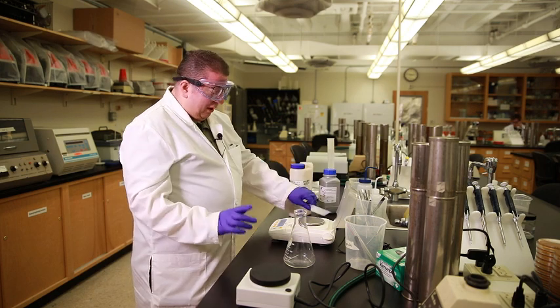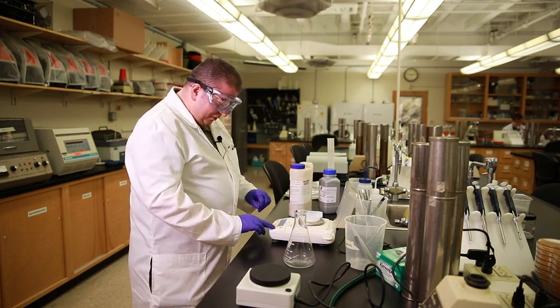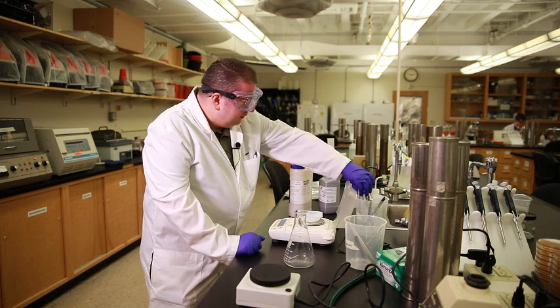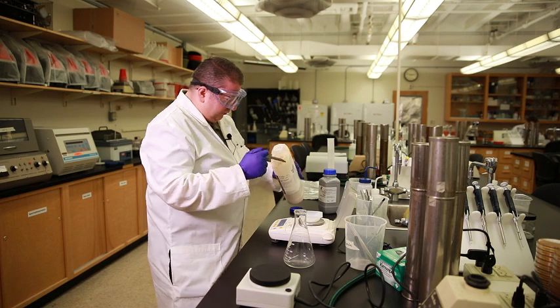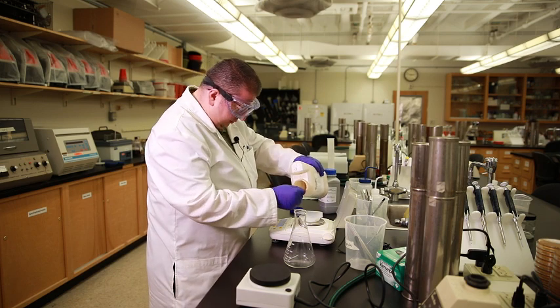So now my balance is on. I'm going to put the weigh boat on and zero it out. Clean spatula, and we're going to measure out the 2 grams of nutrient broth powder.